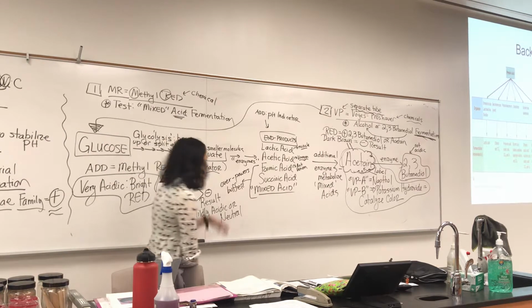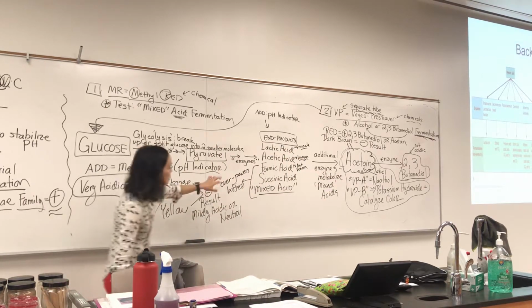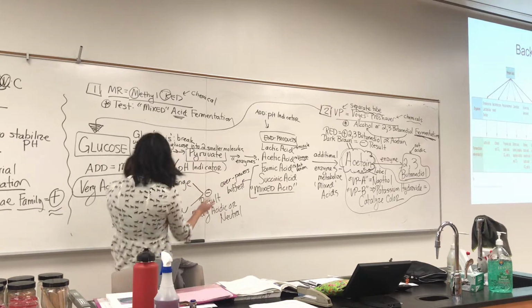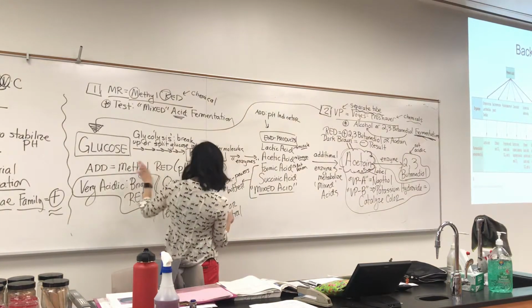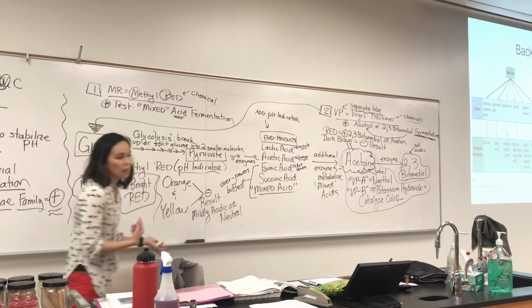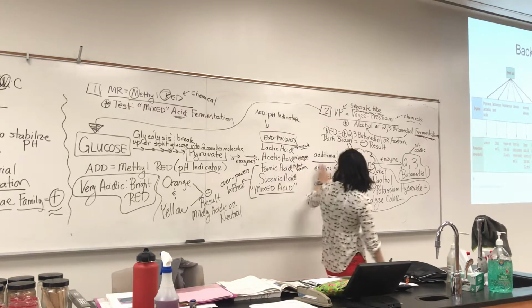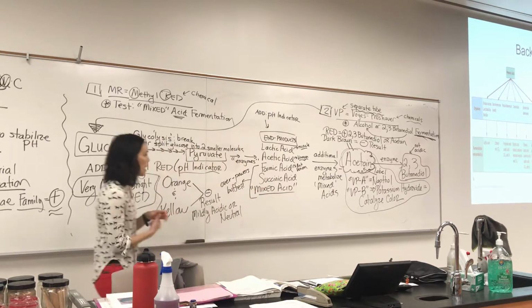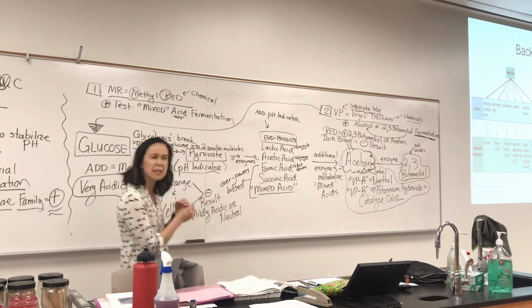The acid was changed. It's all along the same pathway, right? So the bacteria is going to take those acids and metabolize them further into the alcohol. Generally, like Evelyn was saying, if they're positive for the acids, they'll usually just stop there, and that'll be the end of it. Or they will have those extra enzymes, they'll metabolize further and make the alcohol, and they're probably not going to have much acid around because the acids are going to be metabolized into the alcohol. Does that make sense?